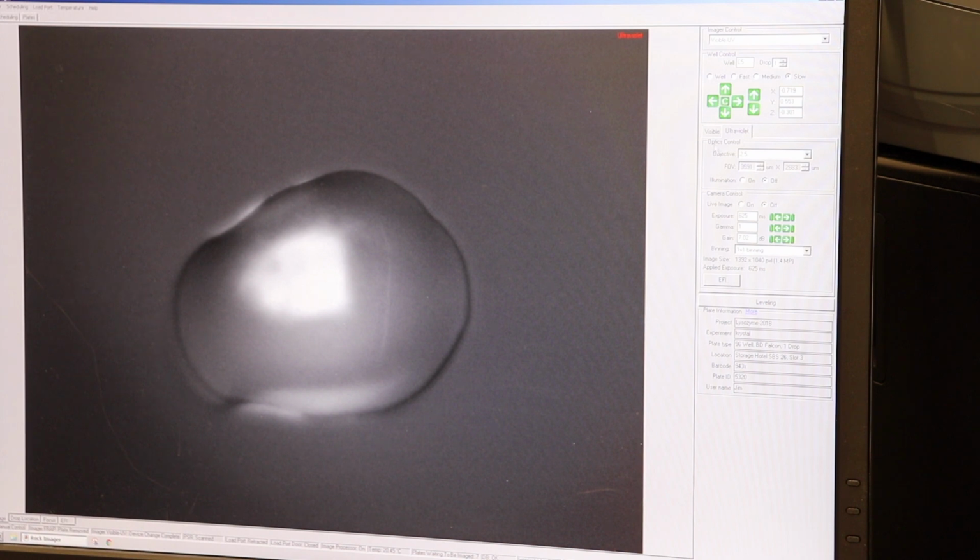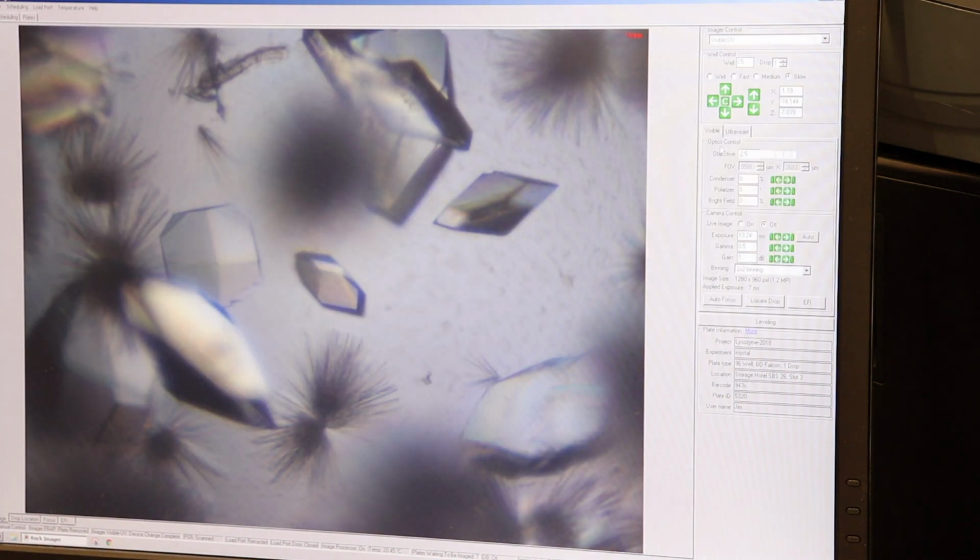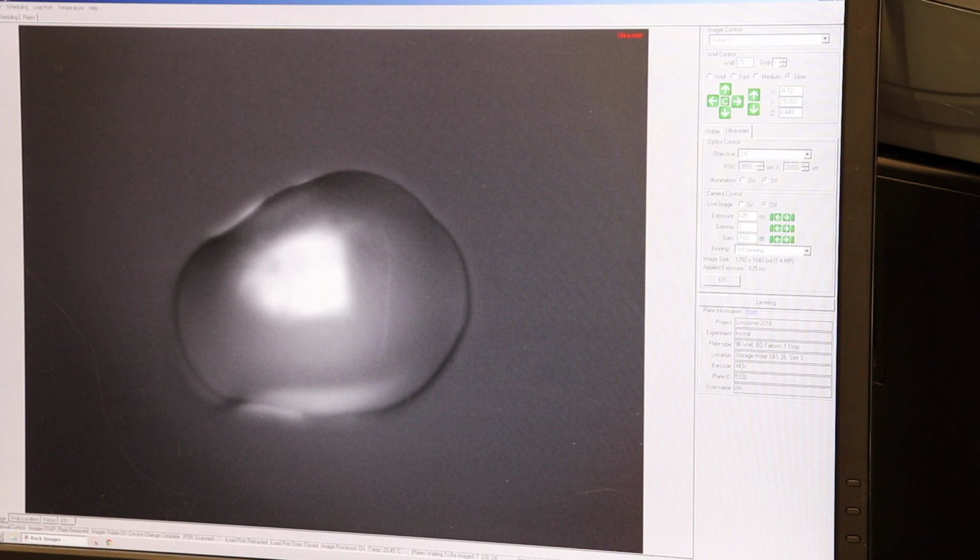on. One big difference between the visible and the UV is the zoom objectives. So in visible, it's a sliding gradient from 1 to 11.3, and you can get anywhere in between, and you can even select particular values. We'll go there. In UV, you have 3 choices, 2.5, 5, and 7.